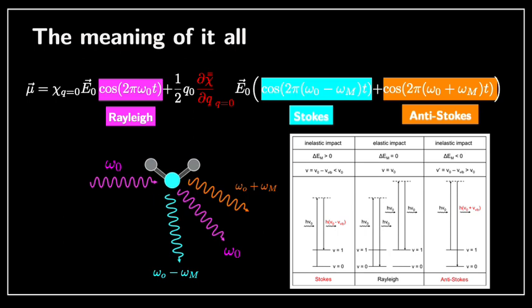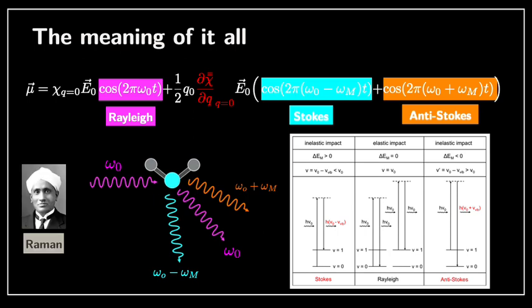Okay, so I think it's very nice. Now this technique was first thought by Raman many decades ago, and this is why it bears his name. Okay, so this is basically how Raman spectroscopy works. This is an important slide to understand, and I have to say it's all based on a classical description of interaction between light and the material.